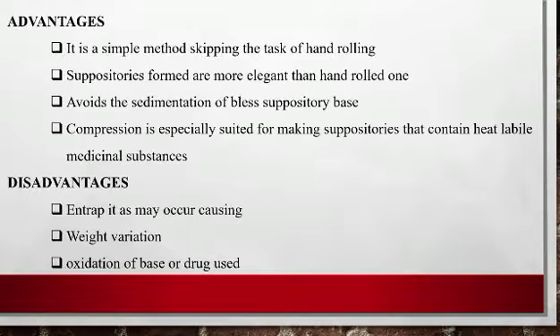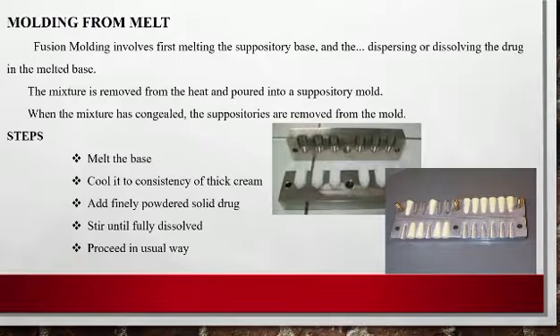The disadvantages are air entrapment, which causes weight variation, and oxidation of both the drugs and bases. So these are certain advantages and disadvantages of compression or cold compression molding. And the next method is molding from melt.